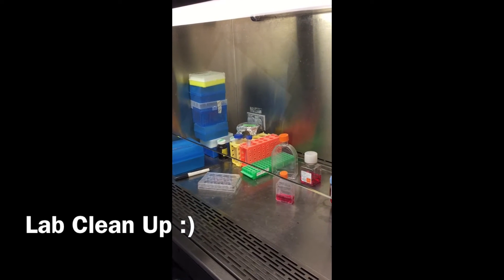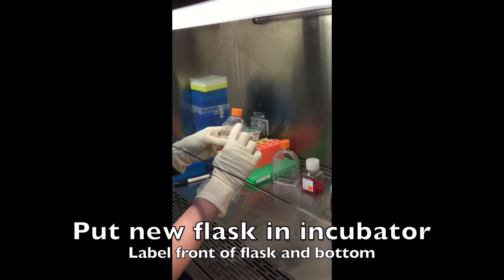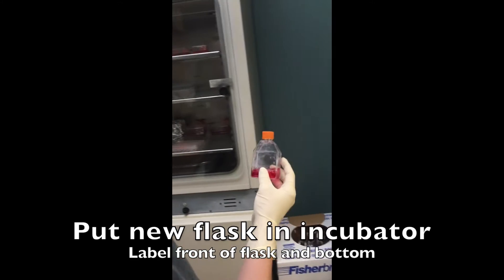When you're done splitting or working with any of your cells, you want to make sure and take your new flask. It's labeled correctly — label it also on the bottom so you can see which one it is in the incubator. Then put it in.